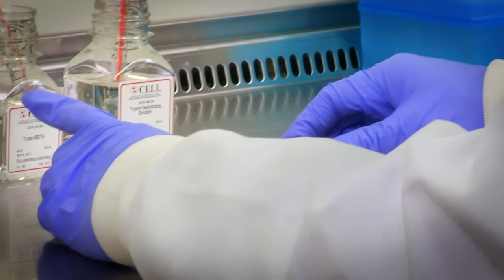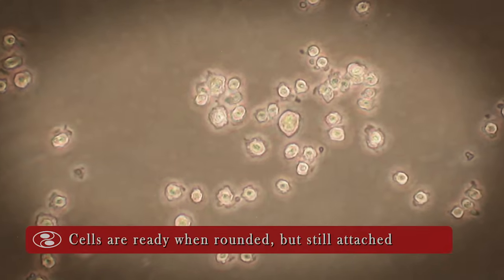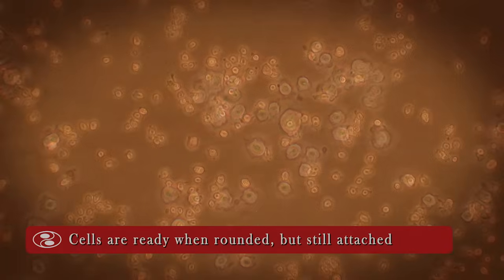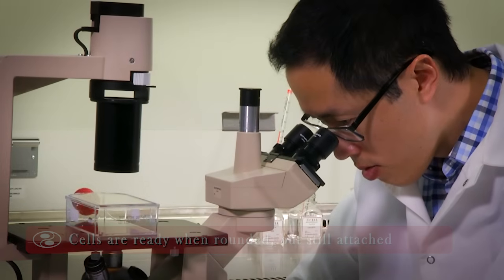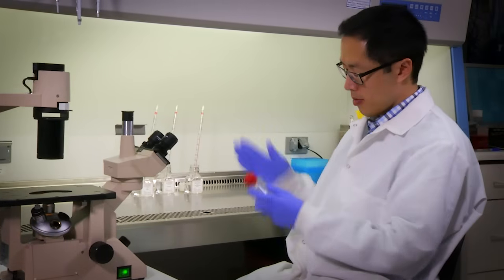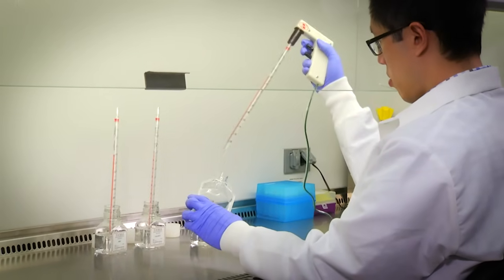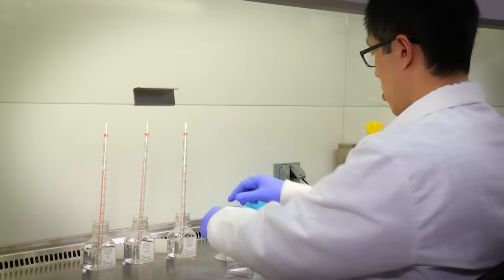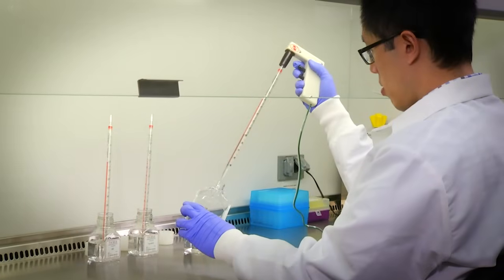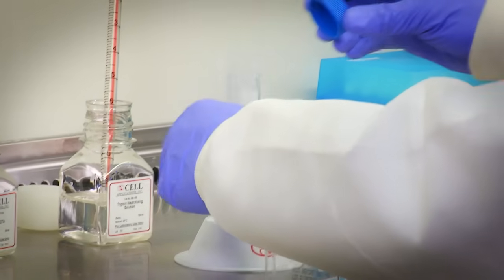Recap the flask tightly and monitor the trypsinization process at room temperature under an inverted microscope. Watch the cells become rounded while they are still attached to the flask — this may be about 1 to 2 minutes after the trypsin EDTA was added. Do not over-trypsinize by waiting for the cells to detach. Instead, detach the rounded cells by hitting the side of the flask against your palm. Pipet 5 ml of trypsin neutralizing solution into the flask to inhibit further trypsin activity. Transfer the cell suspension from the flask to a 50 ml sterile conical tube.